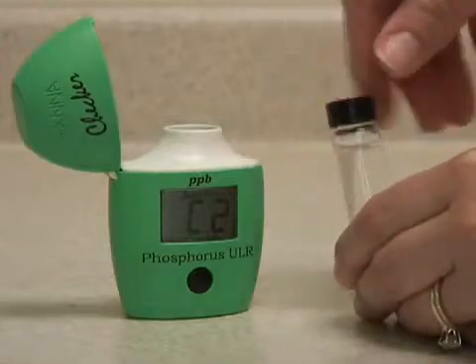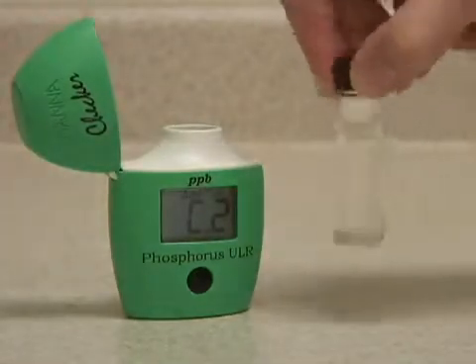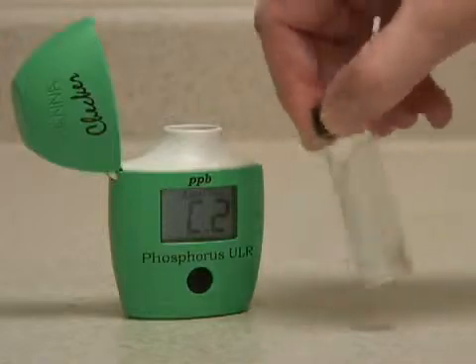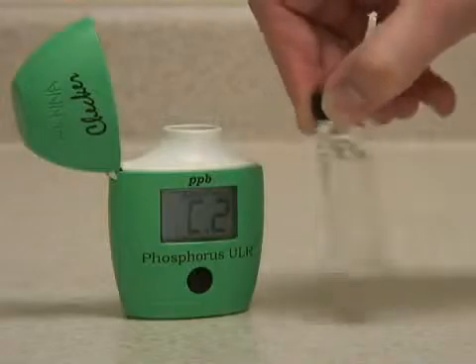Now you want to replace the cap and mix the sample. This is best done by gently swirling or inverting the cuvette. You want to avoid shaking it too vigorously, as this will introduce micro bubbles that can throw off the reading.